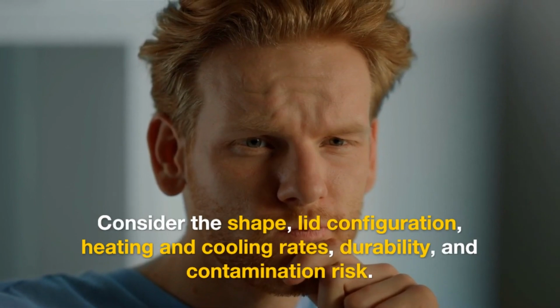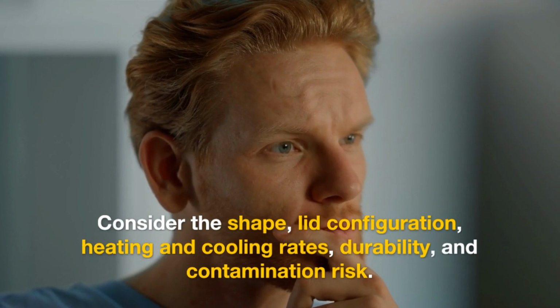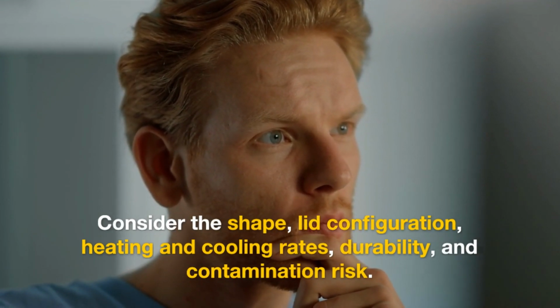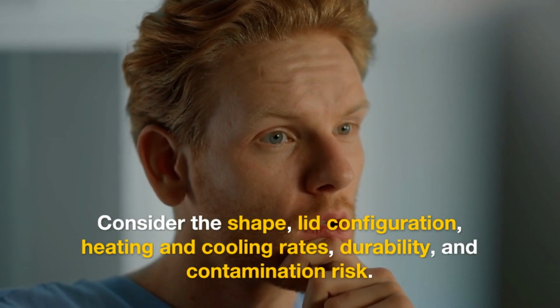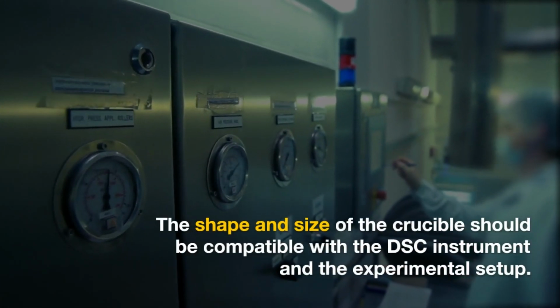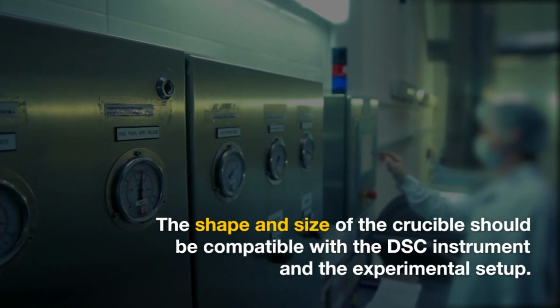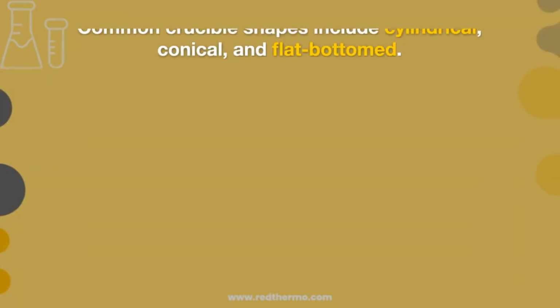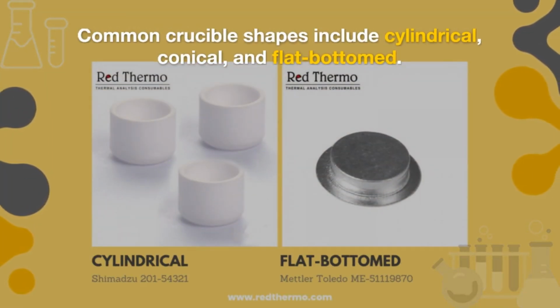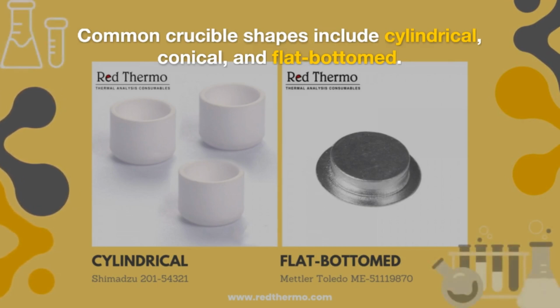The design of the crucible plays a crucial role in maintaining sample integrity, ensuring proper heat transfer, and facilitating easy handling. Consider the following design aspects when selecting a crucible. First, crucible shape and size. The shape and size of the crucible should be compatible with the DSC instrument and the experimental setup. Common crucible shapes include cylindrical, conical, and flat-bottomed. Choose a shape that allows for uniform heat distribution and efficient sample handling.